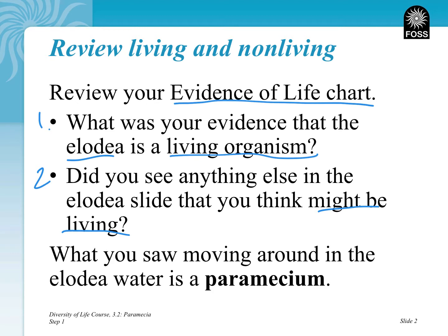Many of you, when we talked about what makes something living, said whether or not it can move. So if you were able to see things moving around that Elodea plant, a lot of them might be a water-based living thing, potentially a moving item called a paramecium. And we're going to focus on those paramecium that we may have seen in that Elodea water wet slide.